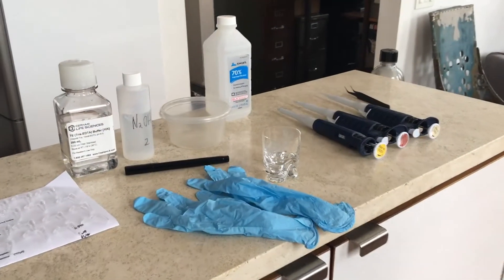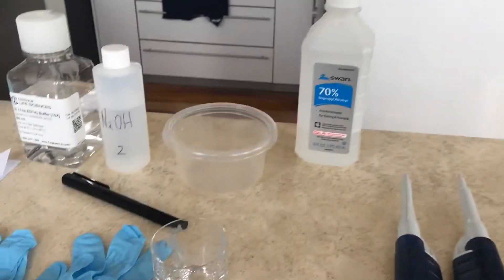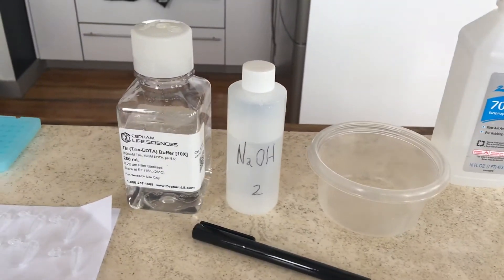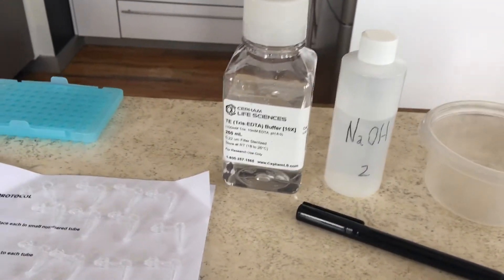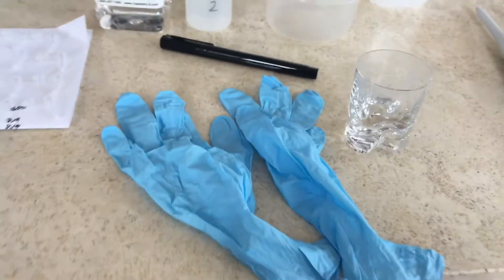These are all the things you're going to need — let's go over them very quickly. You're going to have your micro pipettes, your tweezers, you're going to pour a little bit of alcohol into a shot glass. You have your waste container, your sodium hydroxide, and your Tris-EDTA buffer.